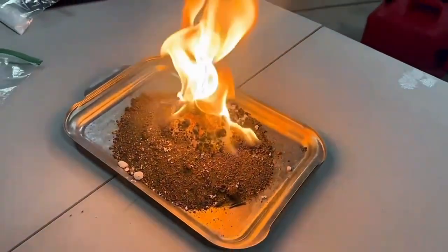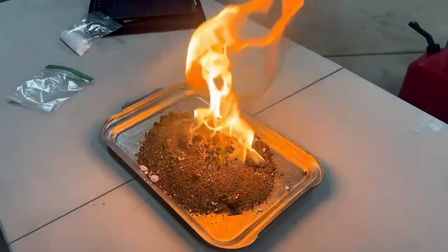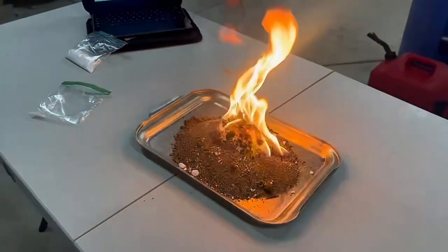I see the carbon, that black stuff, that should be the snake forming, but I think it takes a little bit. So we might have to do a little time lapse.